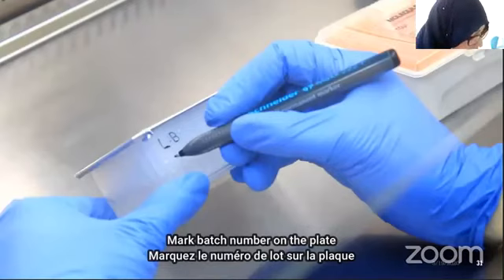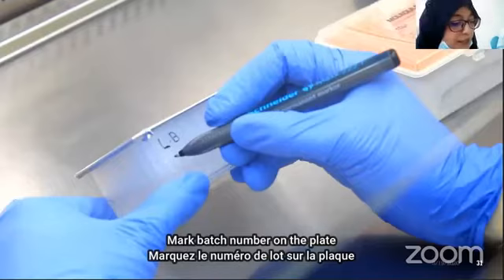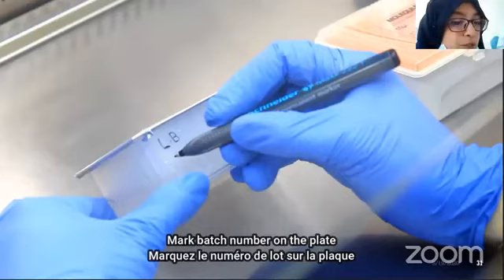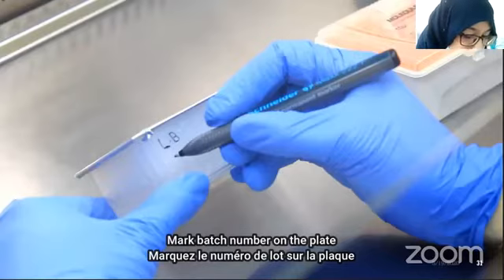The plates are marked by number. Okay, this is the answer actually. Can a sample used for manual extraction also be used for automated extraction? Yes, there is no boundary. There are no boundaries for samples like the swab samples we are using. Can it be used only for manual extraction? No, you can use the same type of sample for both manual extraction and automated extraction.